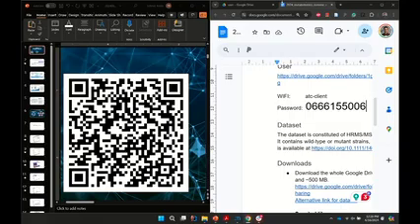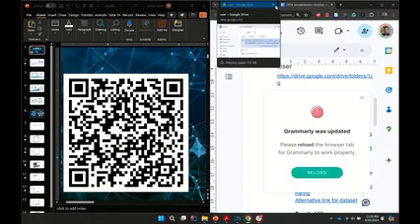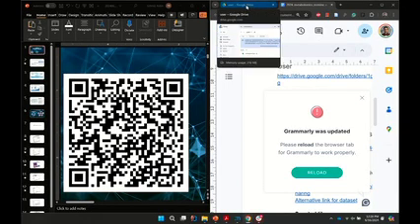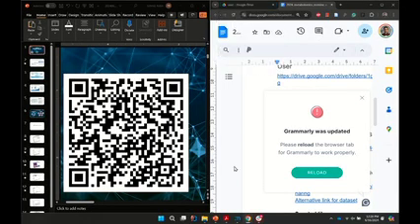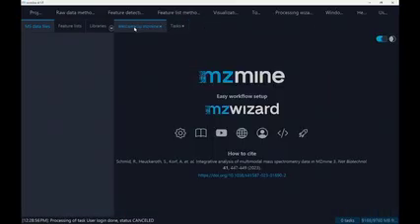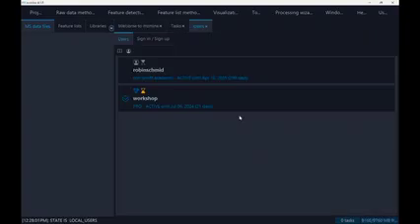I hope that everyone is now able to open MZmine, or if you really struggle, maybe a person next to you is also going through the whole workflow, and I will also go through the whole workflow, so you can have it as a live demo. When you open MZmine, you will see this Welcome to MZmine screen, and you can click on the user and then on Sign in or Sign up.